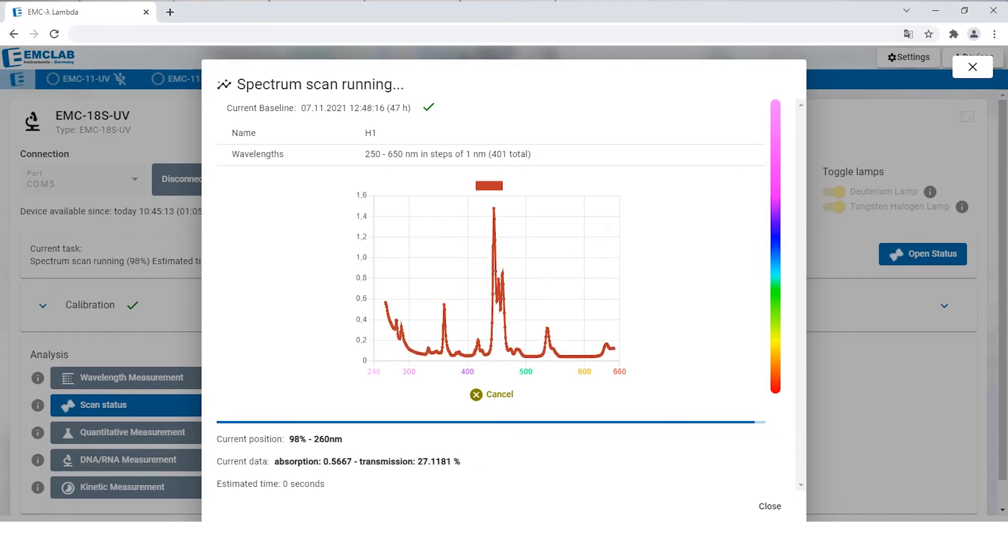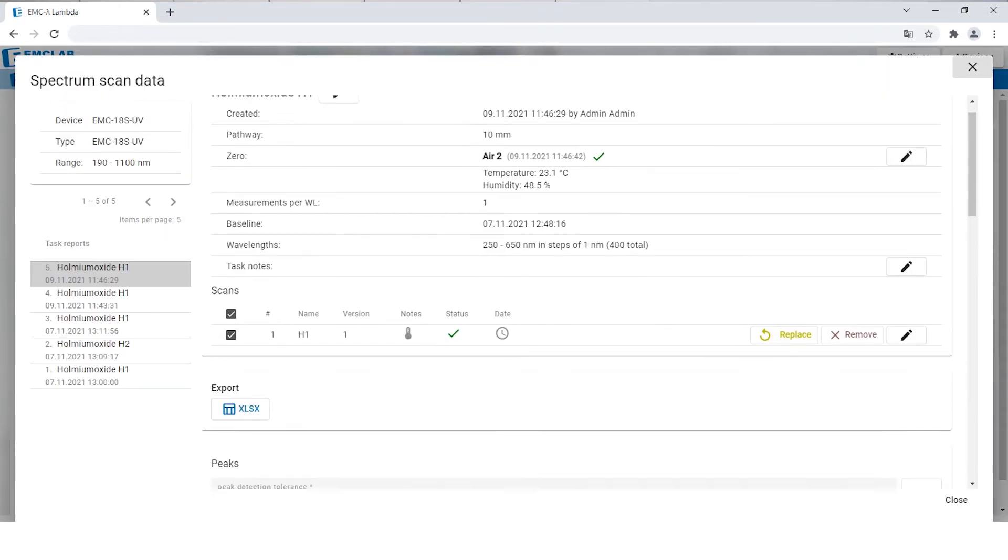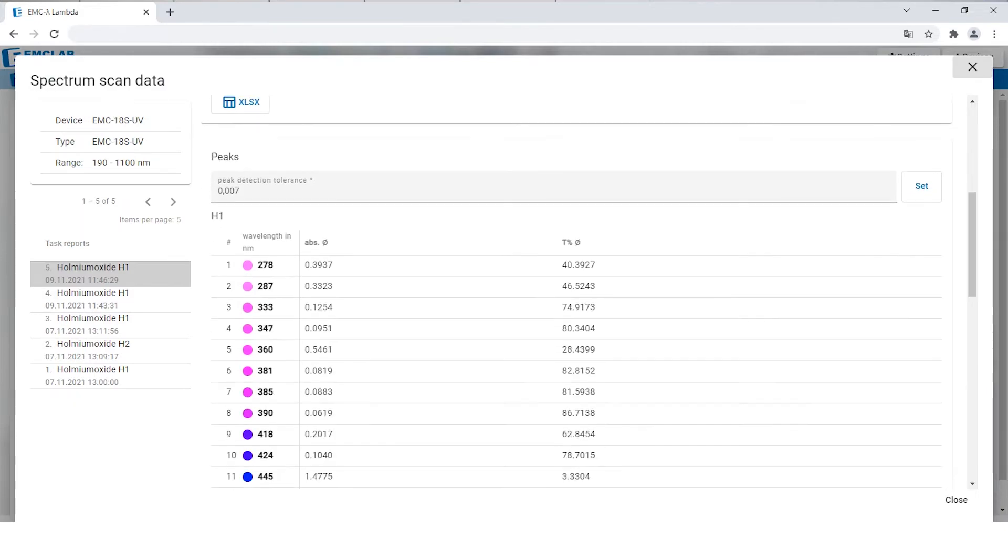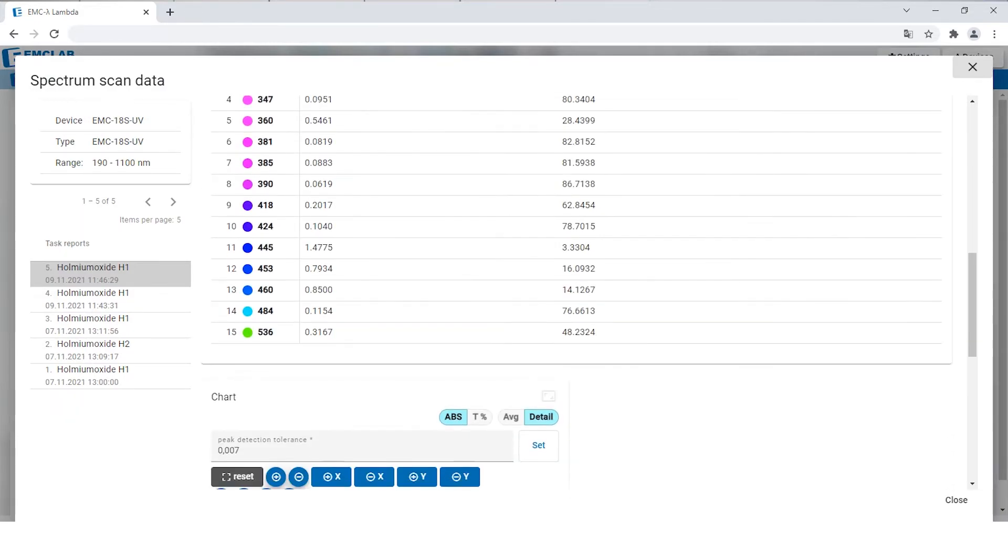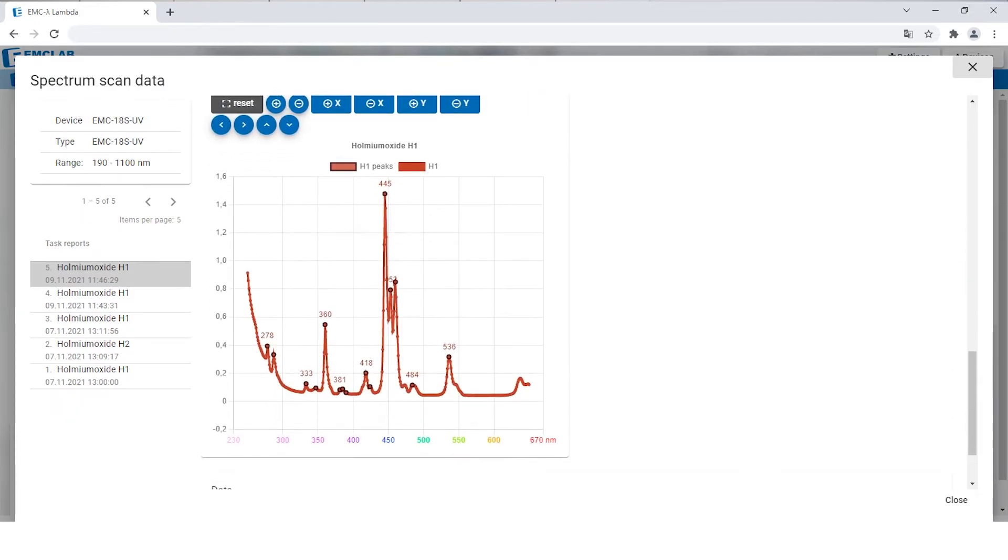After it is finished, click on data to see the results including a graph of the spectrum scan where you can see the peaks in relation to one another.